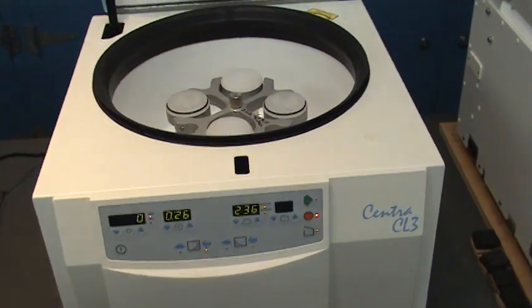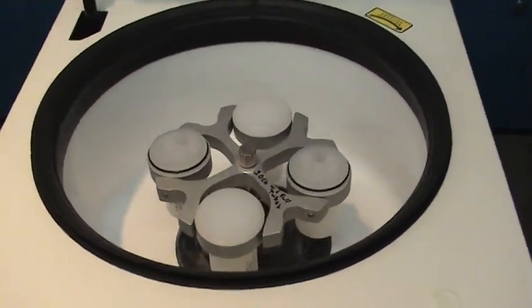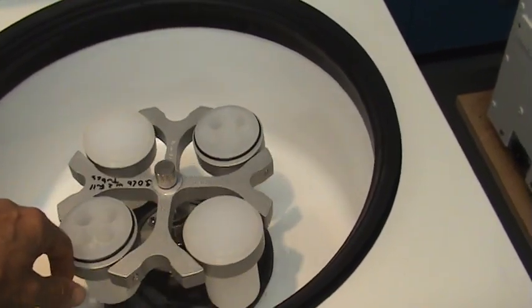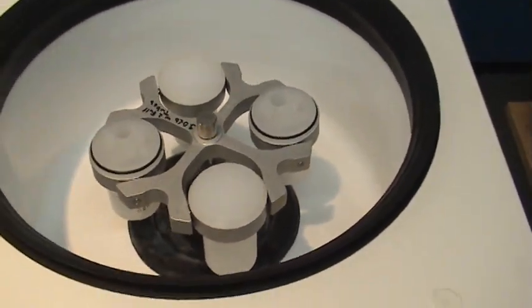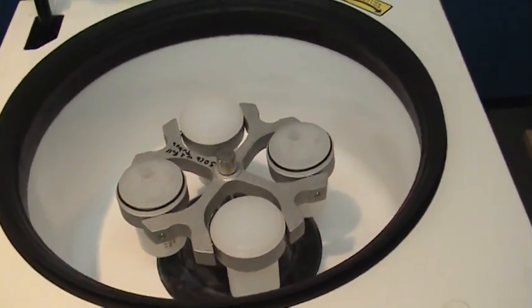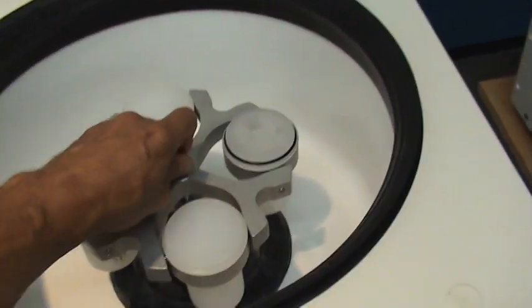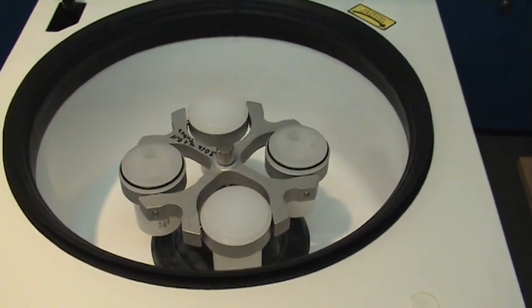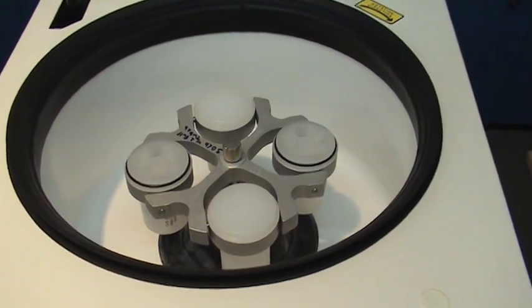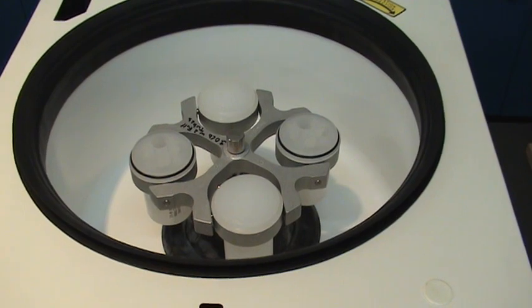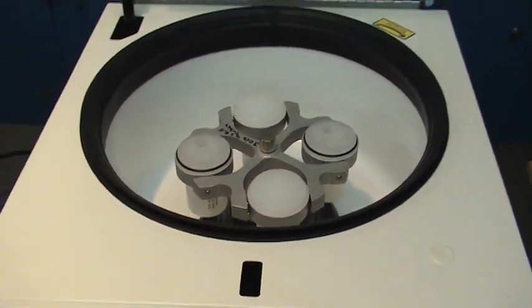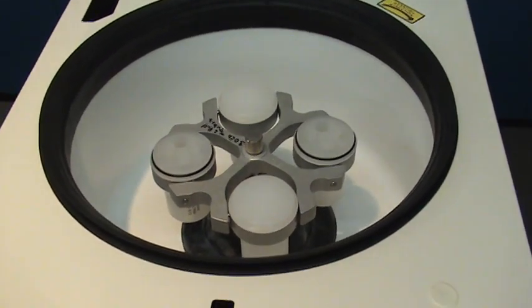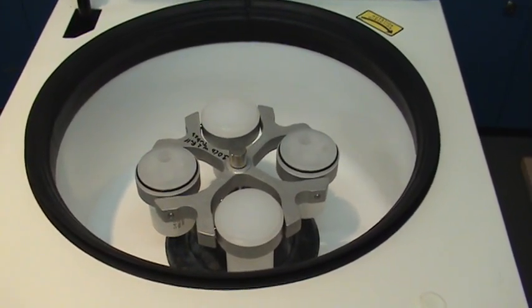If we open the lid of the centrifuge, this particular model has a standard rotor. This rotor when fully loaded weighs about 3 pounds and you'll see that this centrifuge has a mechanism built into it that allows the rotor to adjust to some extent to the imbalance of the centrifuge load. This particular centrifuge is capable of tolerating about 10 grams of imbalance mass.